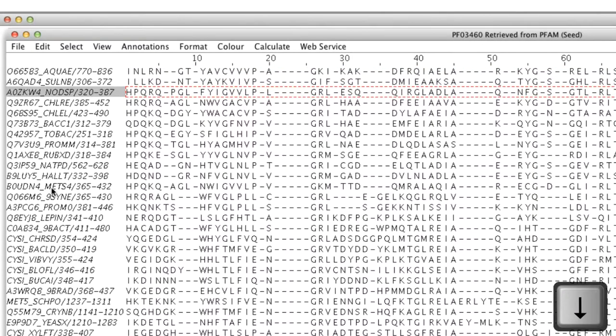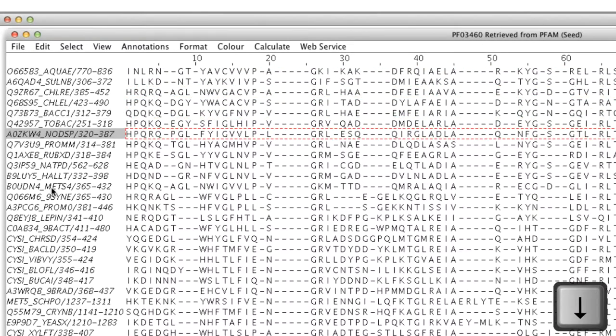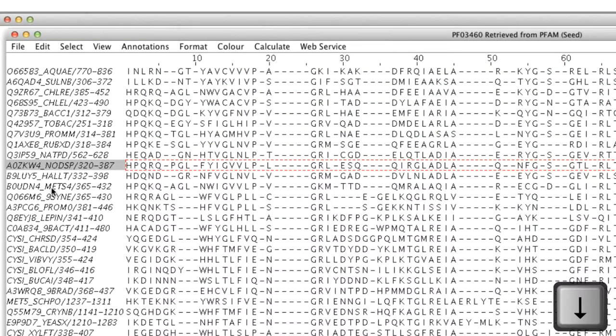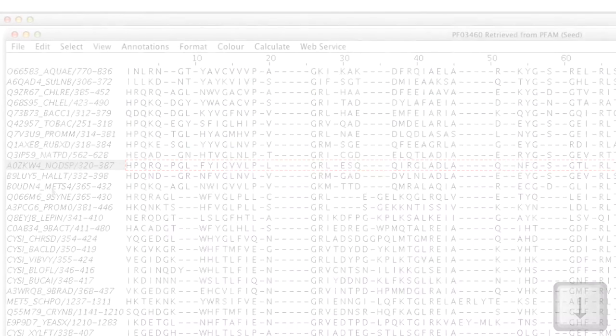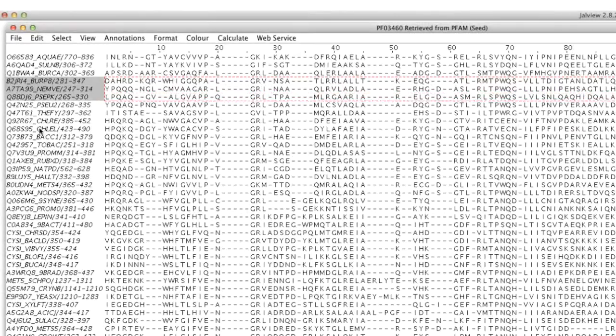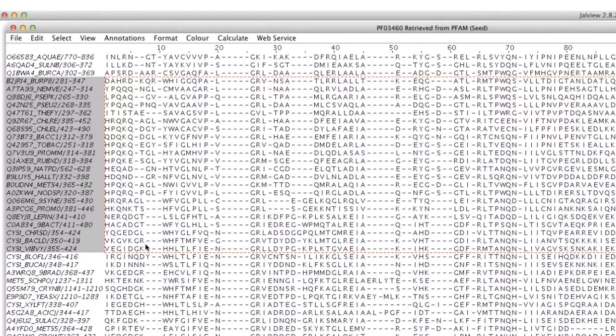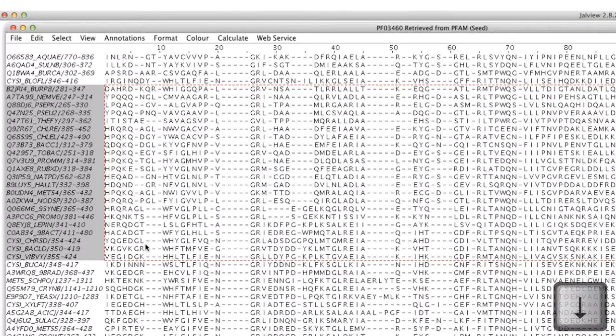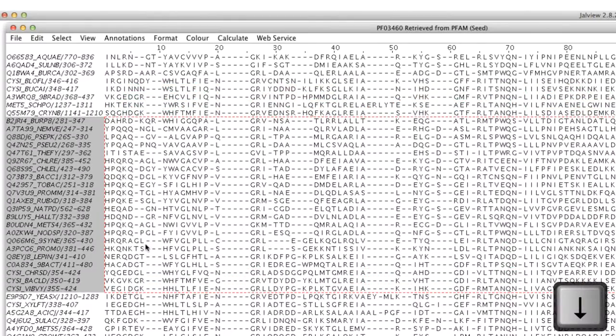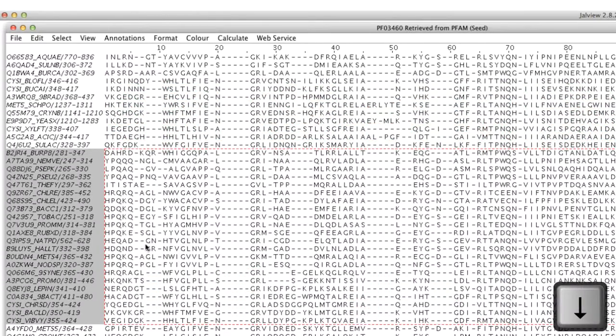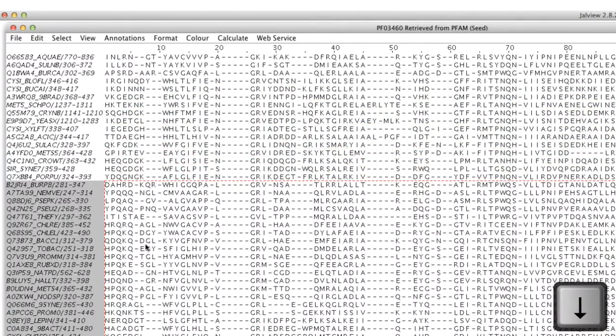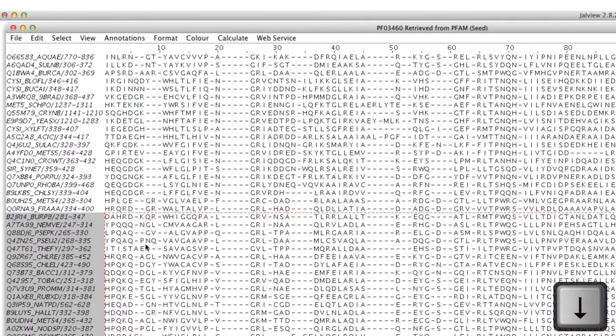Sequences can be moved down using the down arrow key. I can select multiple sequences by clicking and dragging on the Sequence ID panel using the left mouse button. This time I'm using the down key to move the sequences down the alignment.